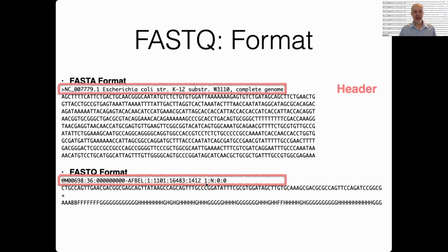And then this is some information that I'm trying to remember. This can either be an N or a Y, and I always find the way they did this confusing. A Y would mean yes, this fails our standard quality control. So an N is good, N means no, this doesn't fail. I would have done it the other way, but that's the way they did it.